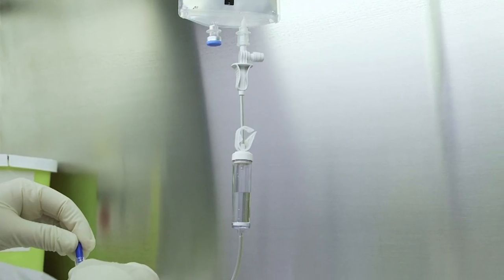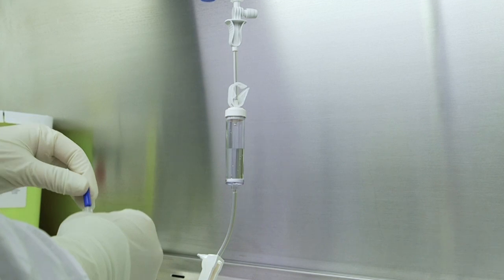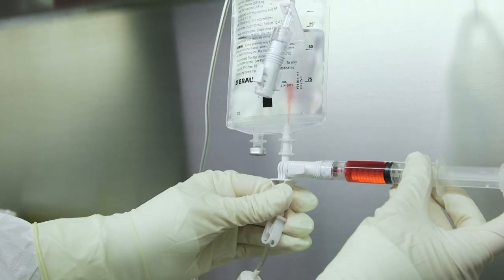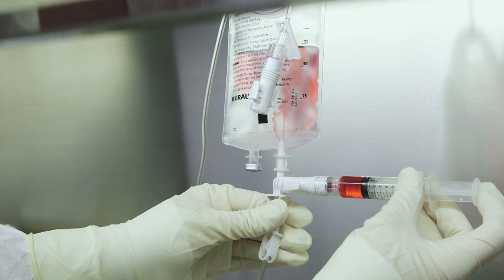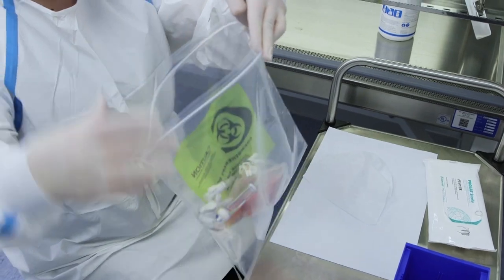CSTDs must be used during the administration of HDs, so depending upon how the drugs are administered, IV tubing must be primed with a neutral solution. The CSTD must be attached to the bag or tubing before the doses are dispensed. Pharmacy must dispense the final HD dose ready for administration without further manipulation.